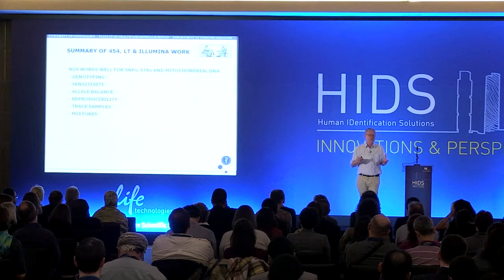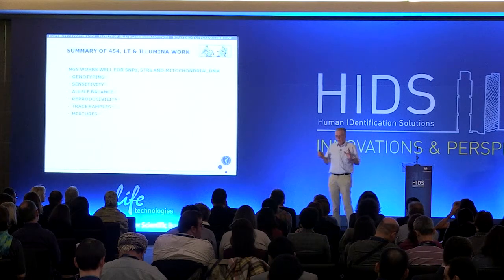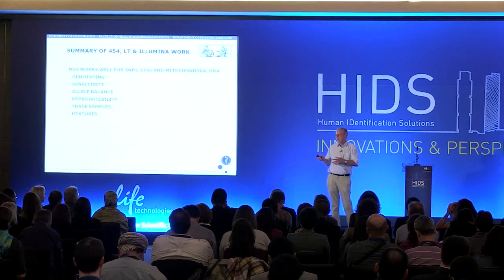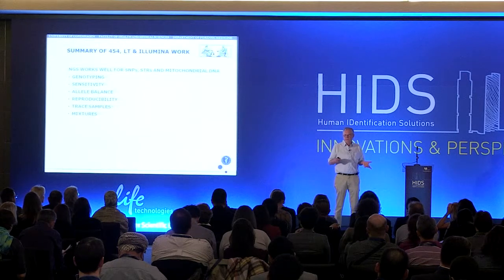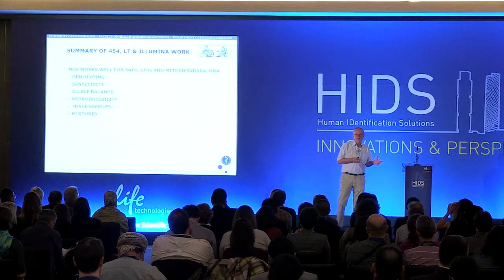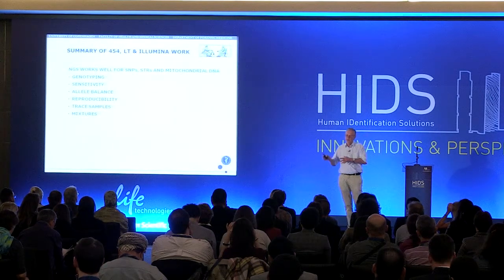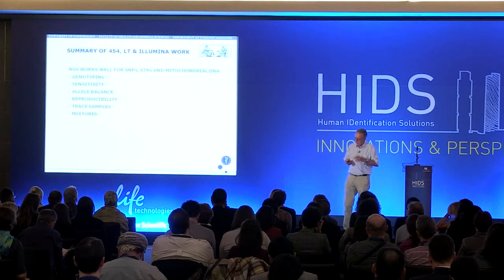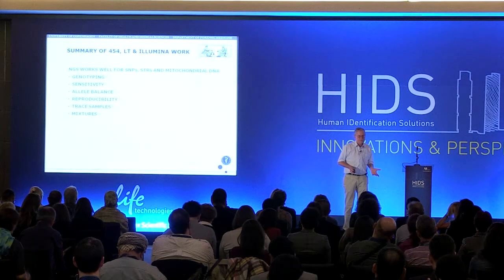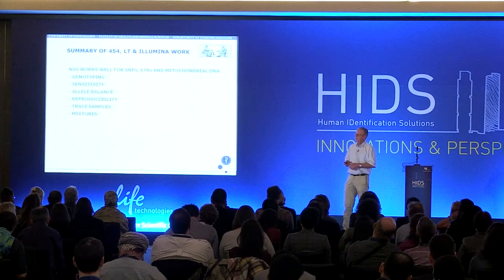It takes a long time to implement this kind of new technology, and we are trying to follow the same strategies as we have for any other kind of testing in our laboratory, which among other things means that we have more than one device for these things, so we separate it in various groups. Which means that a lot of people have to be trained for working with this, and that we are in this process, and we are building up databases.